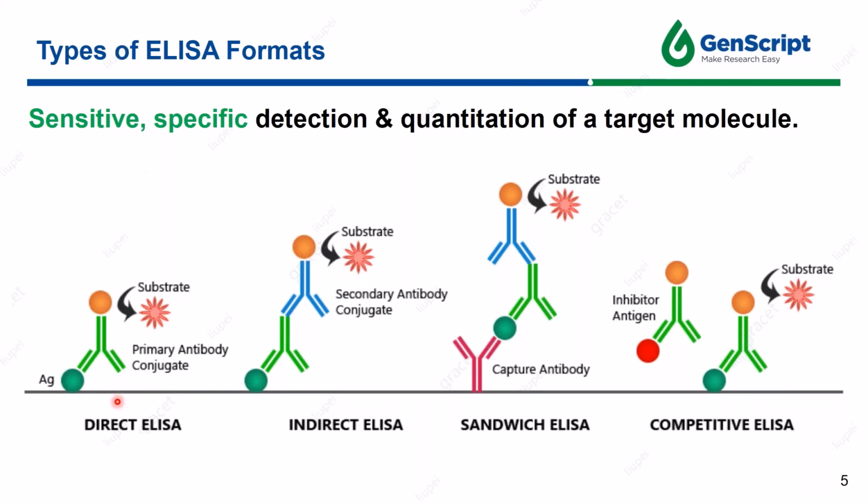The antigen is then detected by an antibody directly conjugated with the enzyme HRP. Direct ELISA detection is much faster than other ELISA techniques because fewer steps are needed. The assay is also less prone to error since fewer reagents and steps are needed. There is no potential cross-reactivity because no secondary antibody is needed.